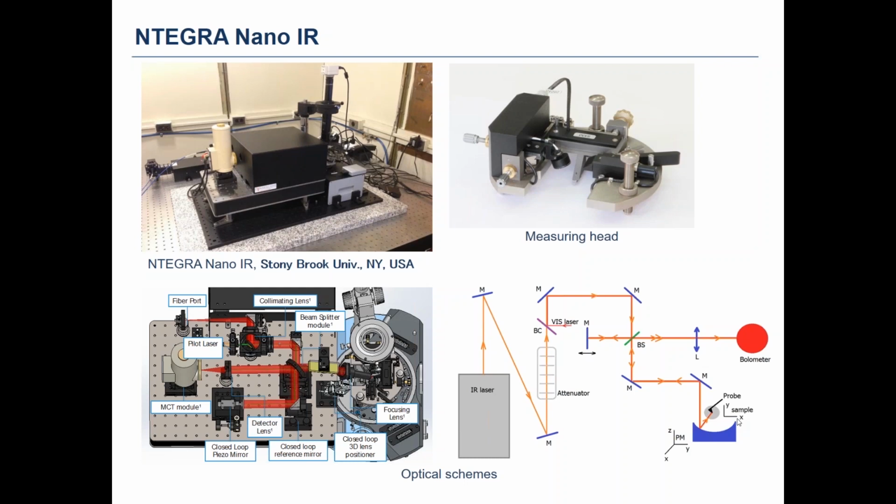Okay, next question. Do you have the tuning fork AFM function in your system? Yes, we do. And I guess there are different types of tuning forks. Which type of tuning forks can you use? Well, we can use both vertical and shear force tuning fork systems.